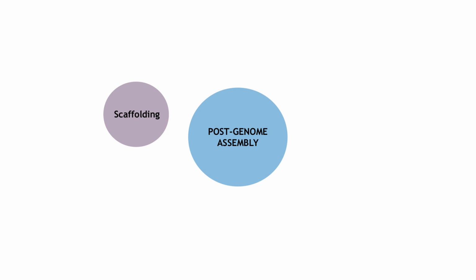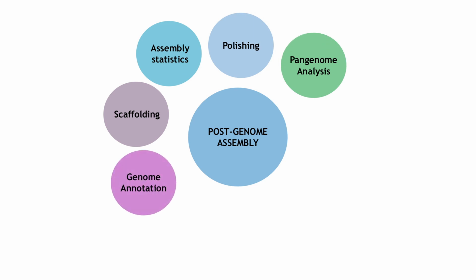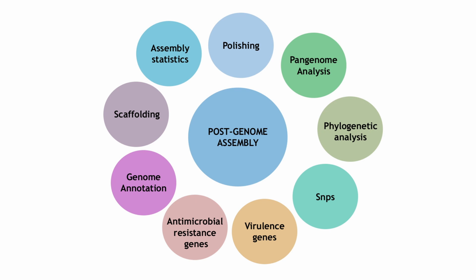So after genome assembly, what's next? There are lots of activities and analyses you can do after performing genome assembly, and here I display a non-exhaustive list of some of these activities. I have also covered some of these activities in detail in separate videos, and if you want to watch those videos, you can click on the playlist that I'm showing right now.